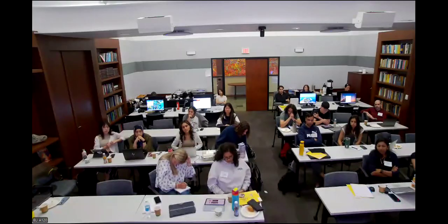Right, so that black line is basically the interface between collagen on one side oriented in one direction and collagen on the other side oriented in the opposite direction. So what are the green and red stripes in that image? It's also collagen, but they're oriented in opposite directions. Okay. Yeah, so the colors are false colors, right? This measurement that I showed is done in a particular way that allows you to see the phase of the second harmonic signal.